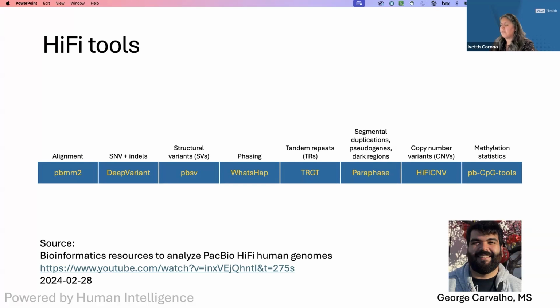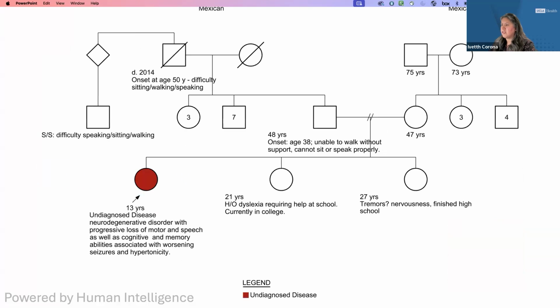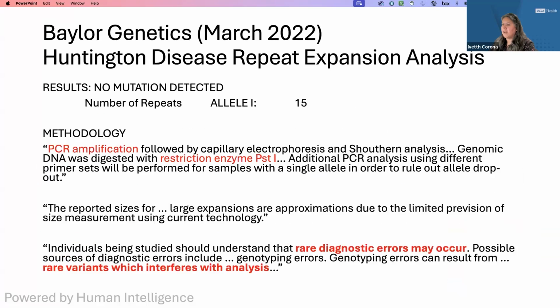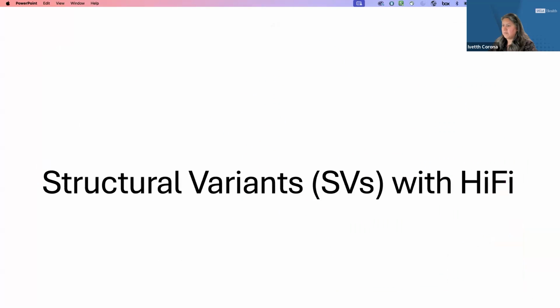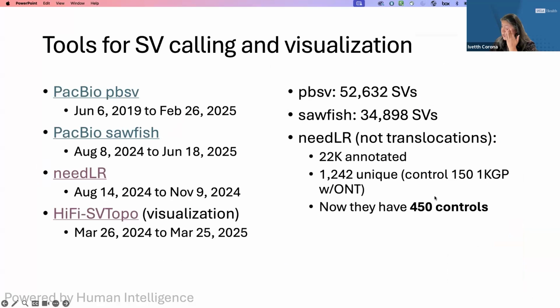So we are still left with thousands of variants to check manually. We haven't been able to narrow down these thousands of structural variants that are called to something that is possible for us to analyze. So we have tools, but I don't think they are right now at the level of helping us solve cases yet. Great, thank you.